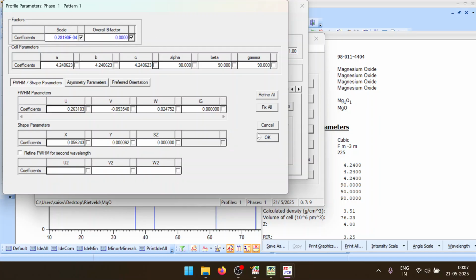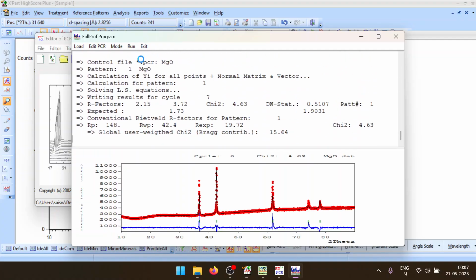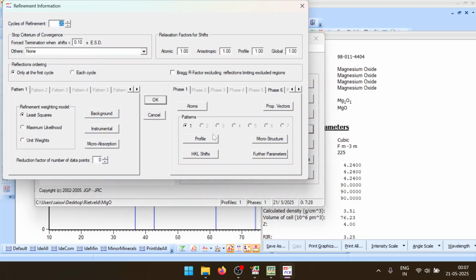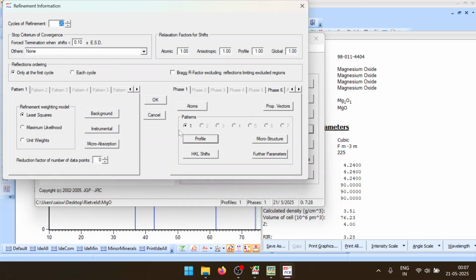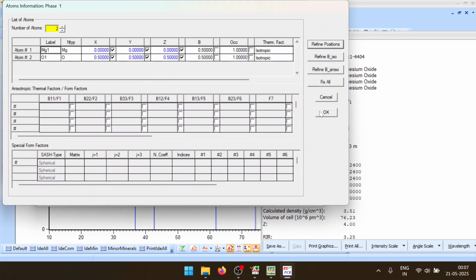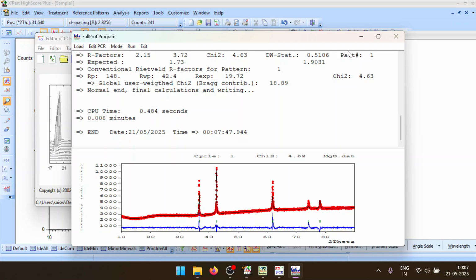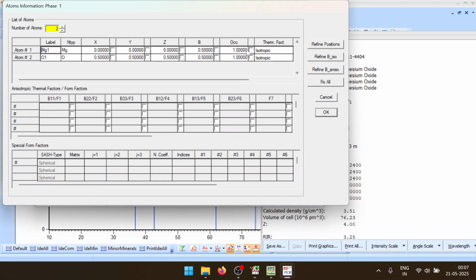Then I do the overall B factor here, because when we tried to do it in atoms, it was giving an erroneous value, like 5 or -1. So I'll be doing these B corrections, temperature corrections, here. Then alpha beta won't change. Asymmetry, I'll show you how to check it. Again, I'll try once for positions. Now I'll try once for occupancies.